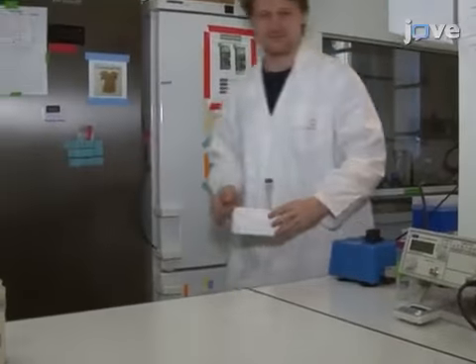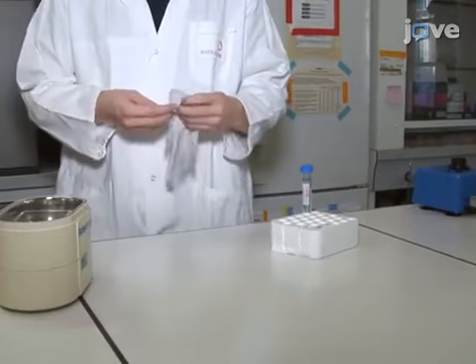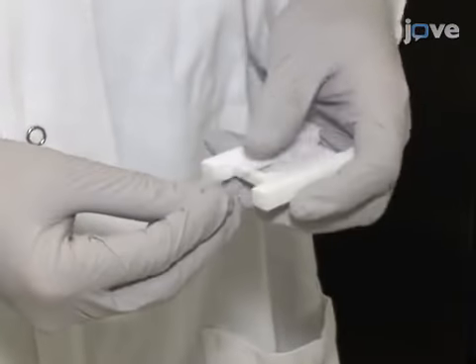After preparing solutions and small unilamellar vesicles containing KvAP according to the text protocol, prepare the electroformation chamber by first inserting the wires through the hole.